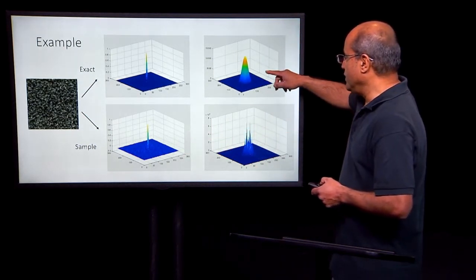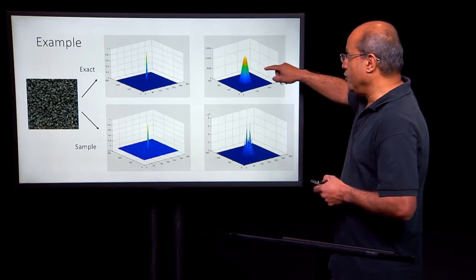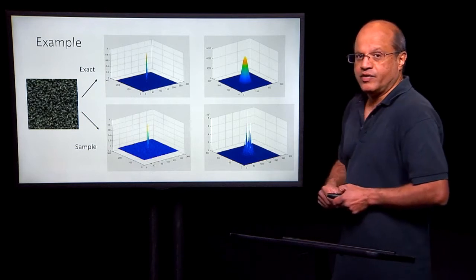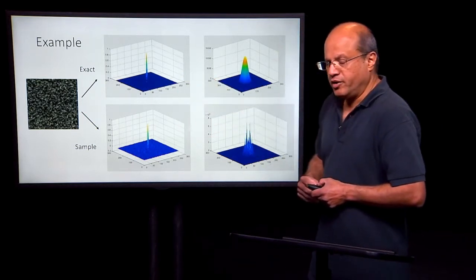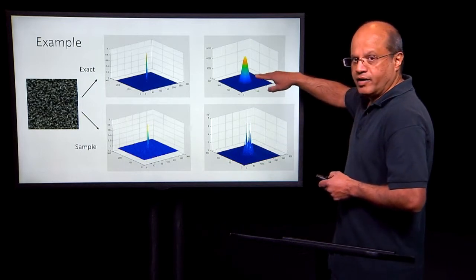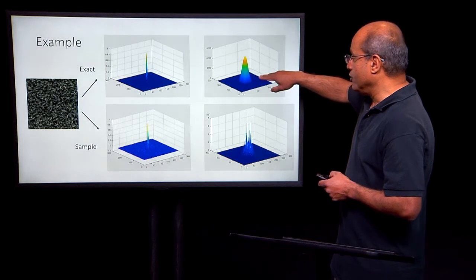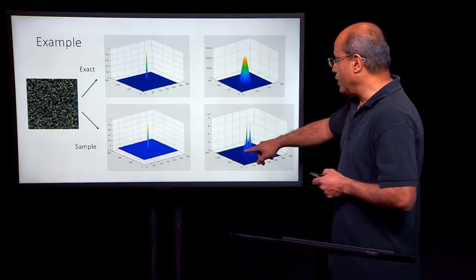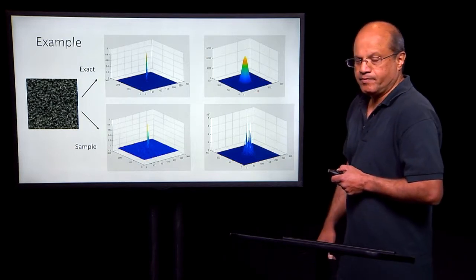And now you can appreciate the difference between something that's calculated using random variables and samples of random variables. So although the autocorrelation functions look similar to each other, their spectra look quite different. And if you're going to use the image spectrum as a model for the true spectrum, you might want to think about maybe smoothing this out so you get something similar to that.